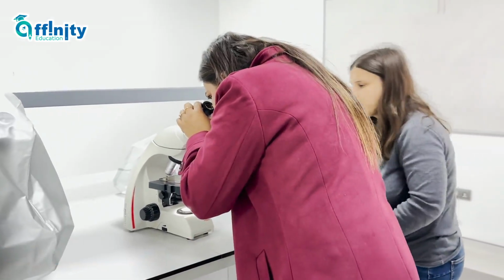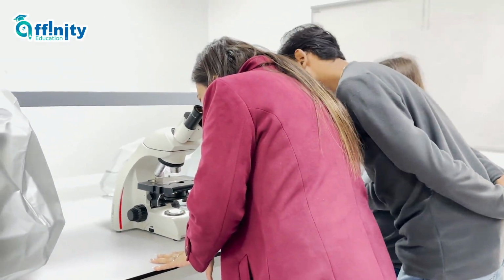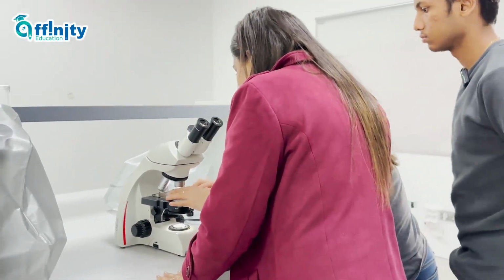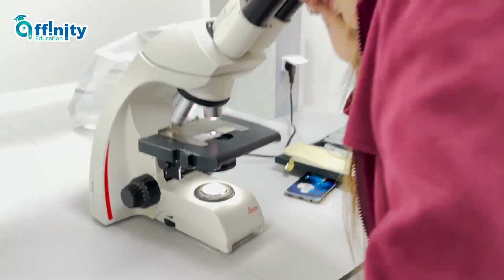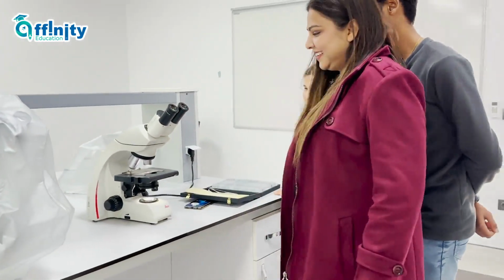You have to look quite a lot in this. More than that. You can see human ovary if you want. Duodenum. That's really nice. You can even take video.